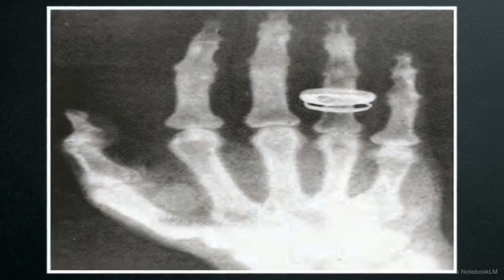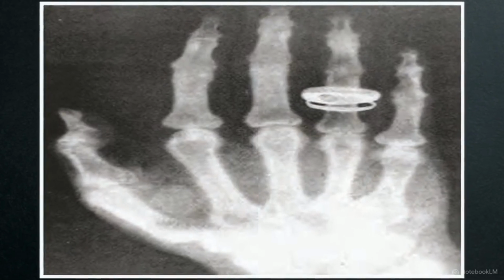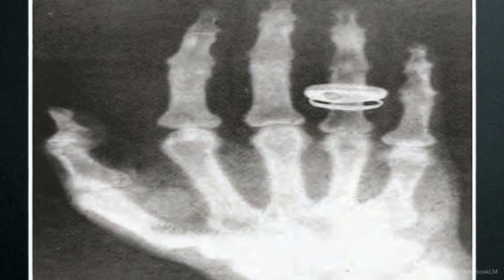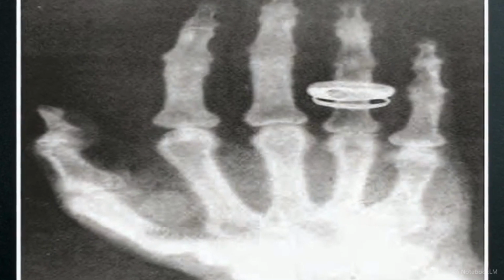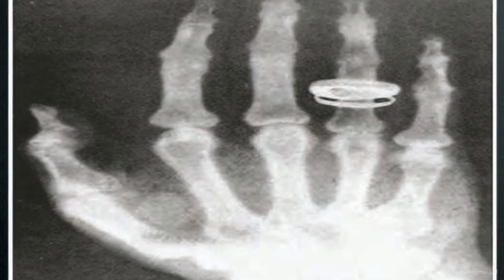In 1896, Röntgen produced this radiograph, establishing X-ray imaging. This visual contrast is a map of absorption. Denser matter, like bone calcium or metal rings, blocks high-energy photons, while soft tissue lets them pass. This shows bulk density, but for locating individual atoms, absorption is useless.